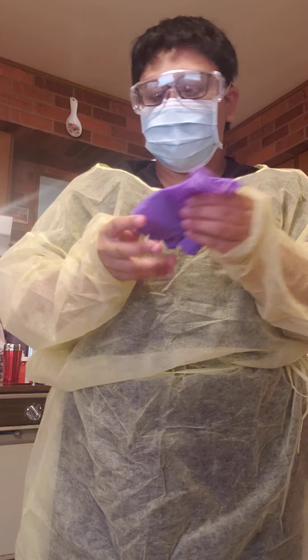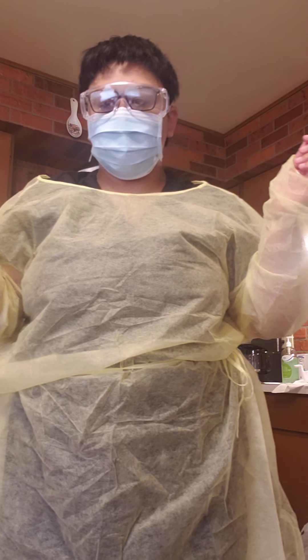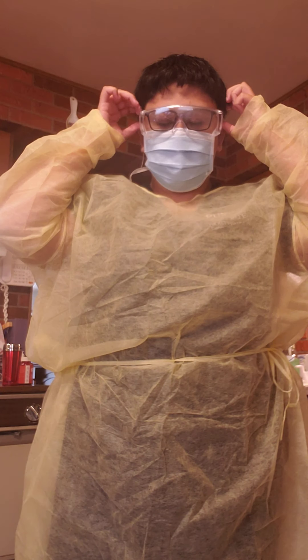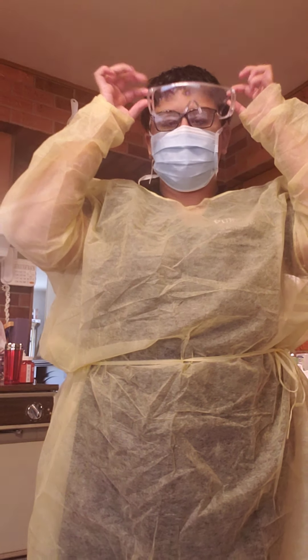Putting it in the same glove and discarding that away. Next is removing my goggles by the ears to either dispose of them or sanitize them as needed.